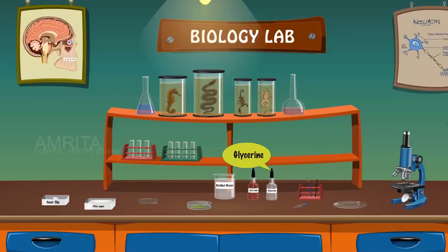glycerine, brush, needle, dropper, watch glass, and a compound microscope.